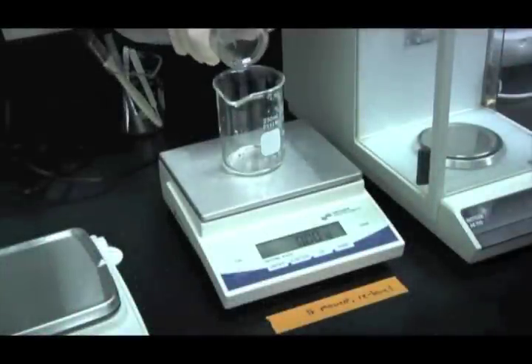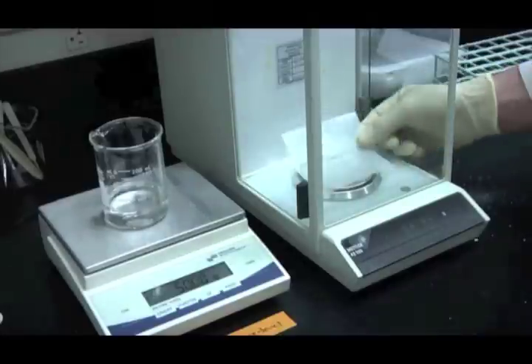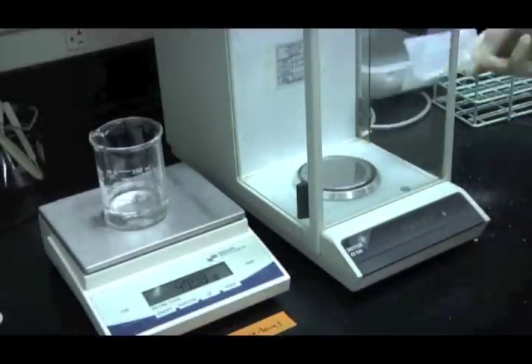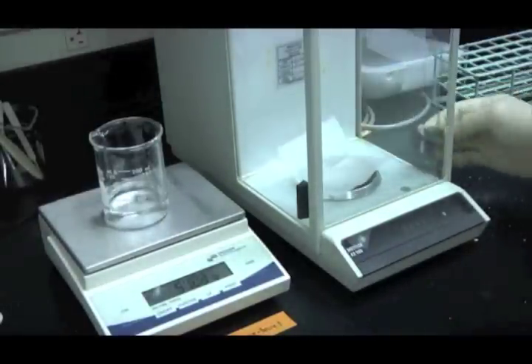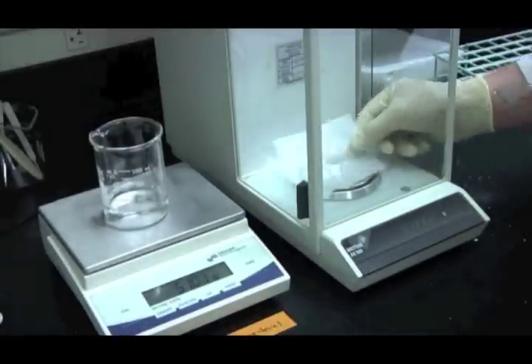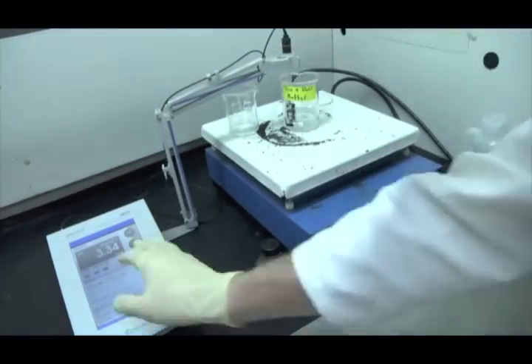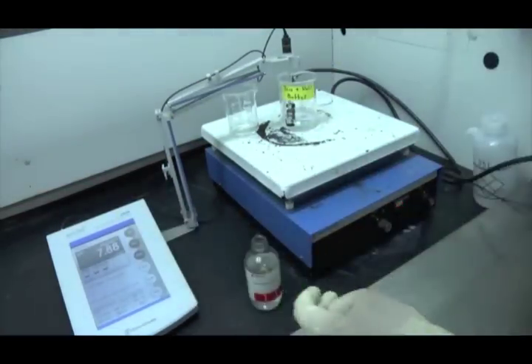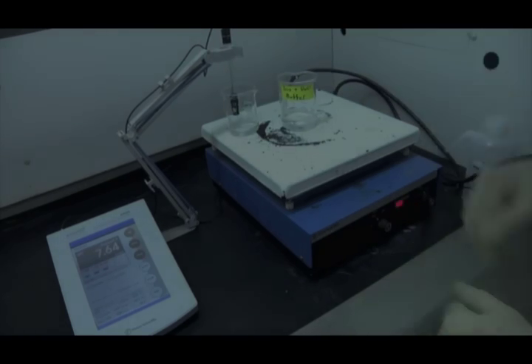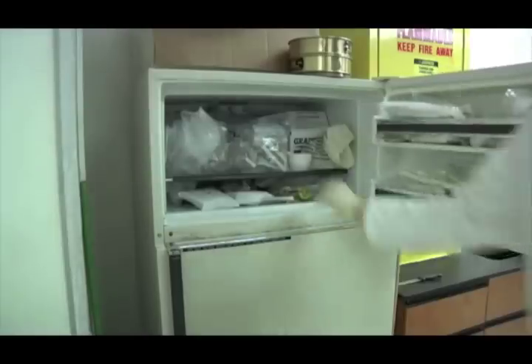To begin the experiment, a tris NaCl buffer of specific concentration is prepared by adding 1.02 grams of sodium chloride and 0.12 grams of tris buffer to 50 milliliters of water, forming a 0.35 molar sodium chloride and 0.02 molar tris buffer solution. The buffer solution is then titrated with concentrated hydrochloric acid to a pH of approximately 7.5. Once the desired pH is reached, the buffer solution is transferred to an ice bath.